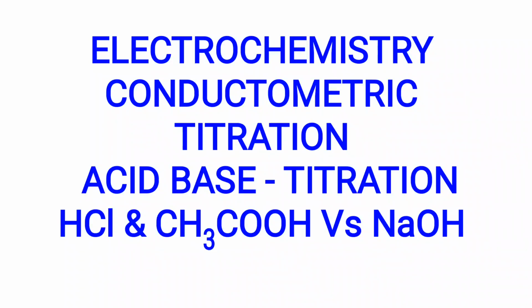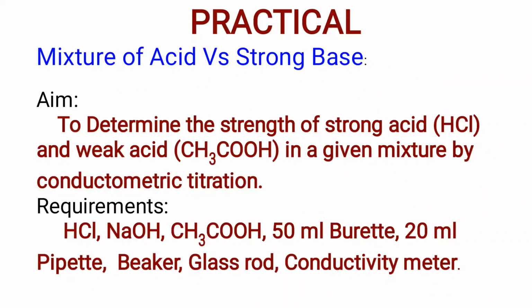In the previous video, we have discussed the topic of strong acid versus strong base and weak acid versus strong base. Now let us come to the topic of a mixture of acid and sodium hydroxide. Now let us come to the practical session for a mixture of acid versus strong base.